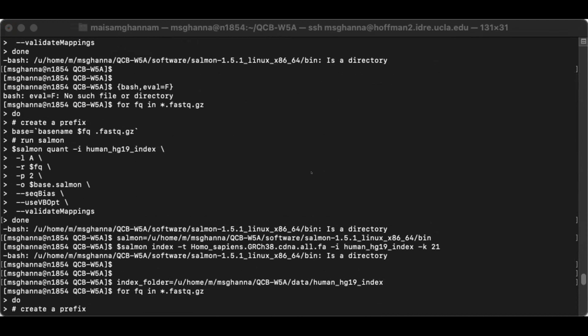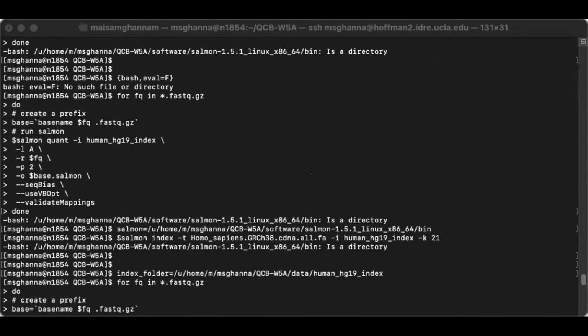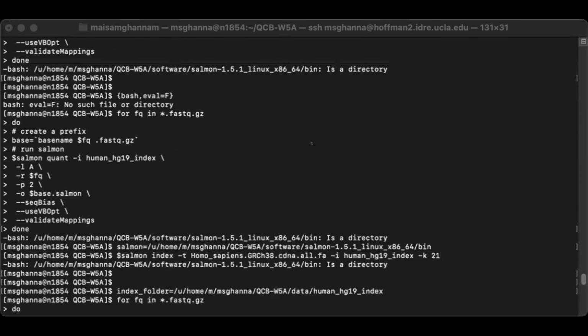Oh my God, seriously? Yeah. After software and before the salmon thing. So after bin, you just have to add /bin/salmon. So you're pointing it to the directory where the executable sits. Index, but now you have to specify the path all the way to the executable.